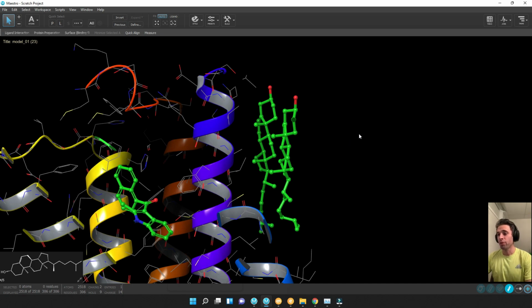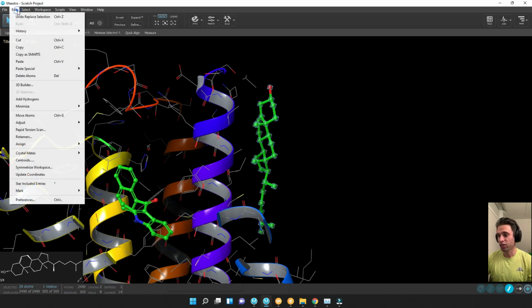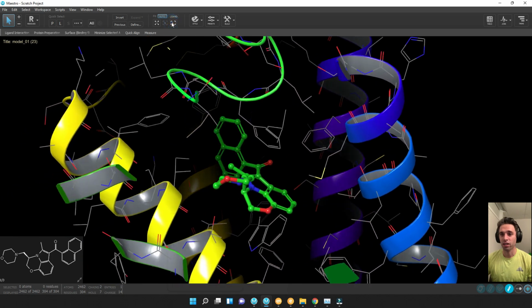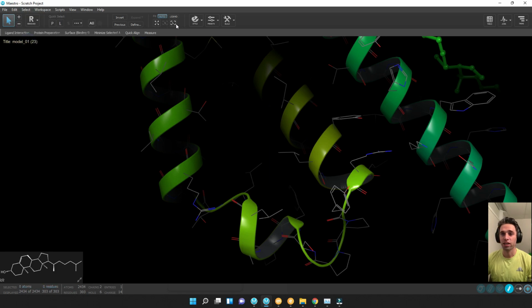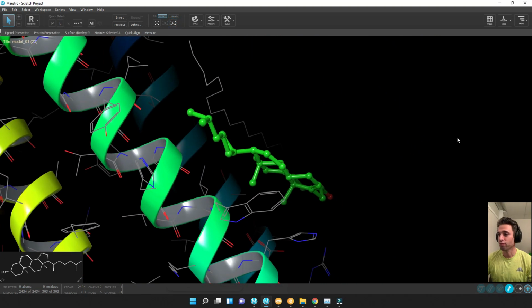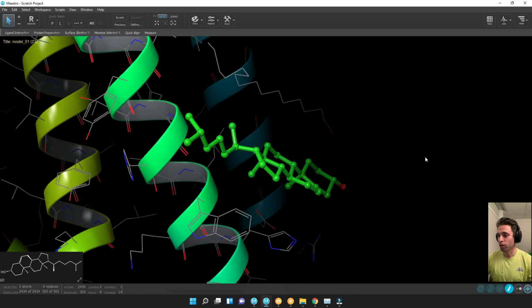cholesterol molecules. The way I'm going to model a lot of this stuff, it's going to be a static frozen system, not a dynamic system that moves, much like if you guys are familiar with molecular dynamics. I'm actually going to delete the cholesterol molecules just to make things simpler to see. So if I click up here, instead of atom, click residue, I can click one of these entries, go to edit, cut, click the entry, edit, cut. If I click L again, it'll take me to my next ligands. Click, edit, cut. Now we have one more.